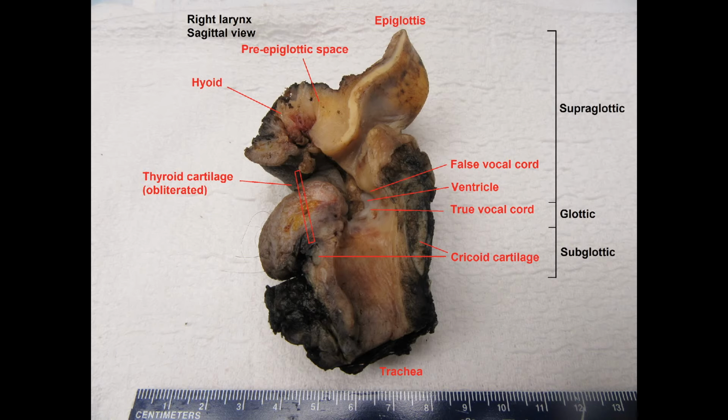When you are grossing these, my view is that they should be grossed as a normal larynx would be grossed, because you'll end up getting the same information that you need if it ends up being a chondrosarcoma. If it's benign, then it's not going to matter. It's just a question of us documenting where it is, what structures it is involving, and really justifying the surgery. So this larynx had to come out because the thing is going into the ventricle, therefore impairing vocal cord mobility.